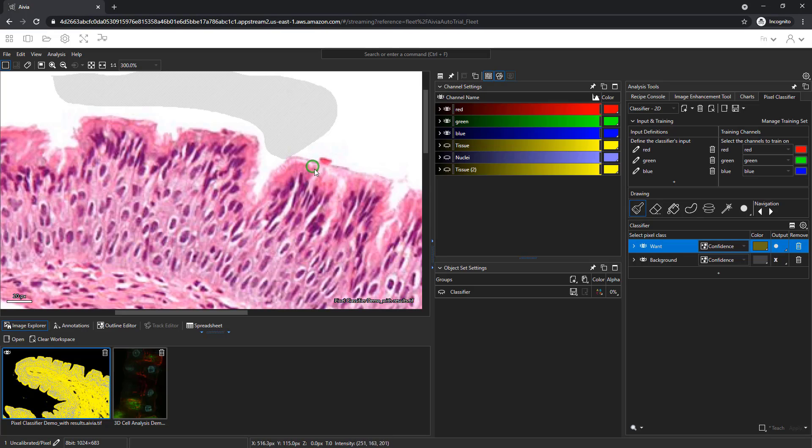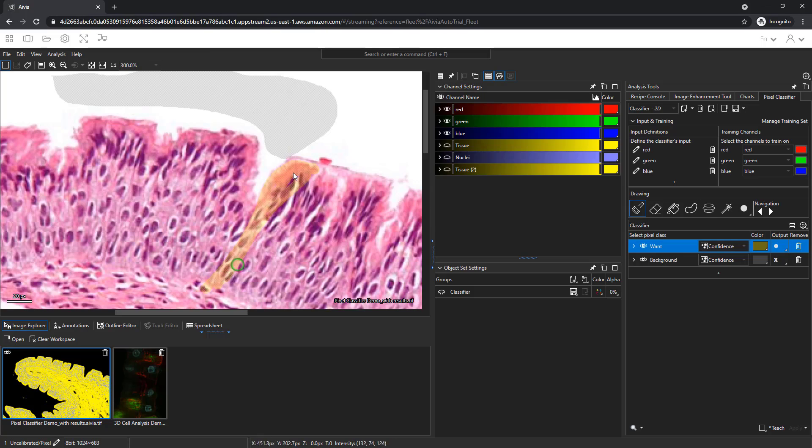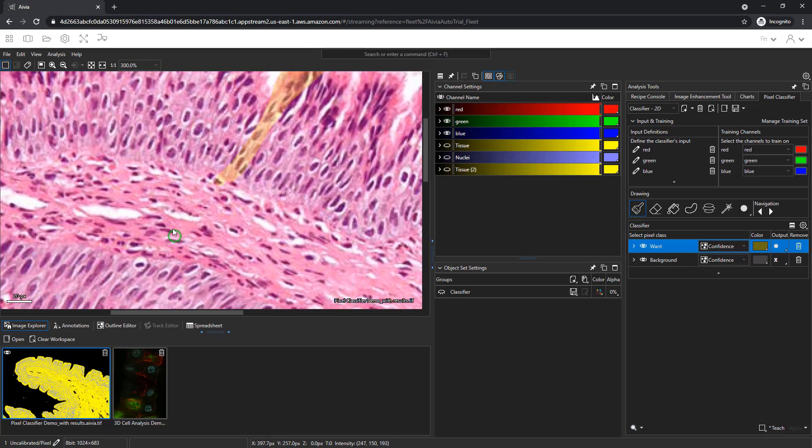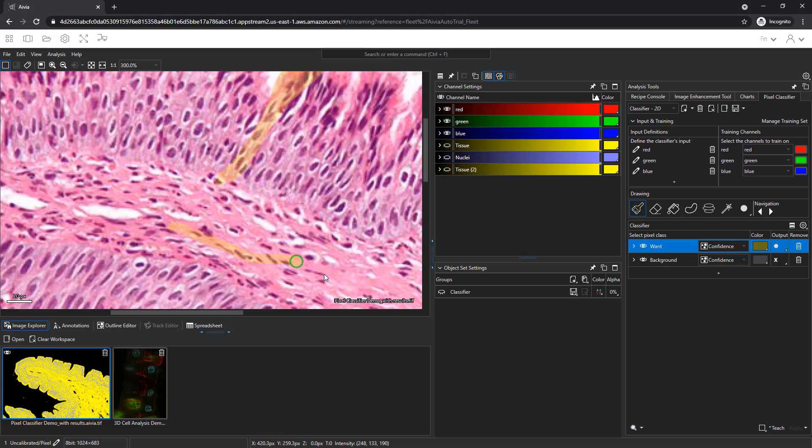Drag your mouse cursor around the image to paint. We'll paint over the entire tissue area, including the nuclei. Right click to pan across the image and we'll repeat the painting to provide additional teaching regions.